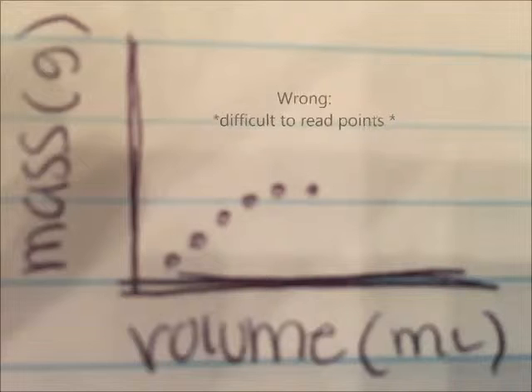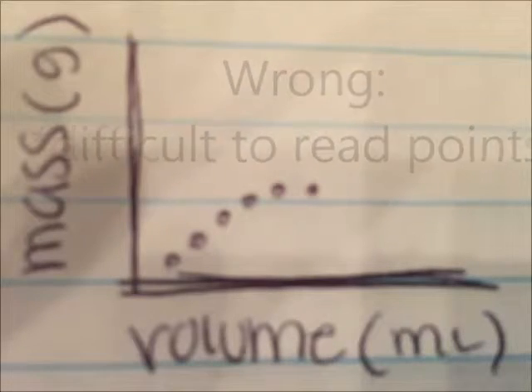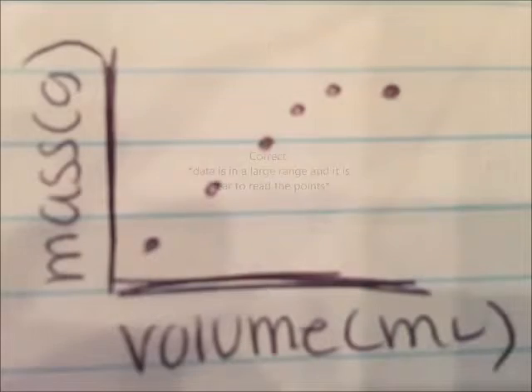It is important that you choose volumes with a larger range of data points. If not, it will be difficult to read. Your graph points should look something like this.